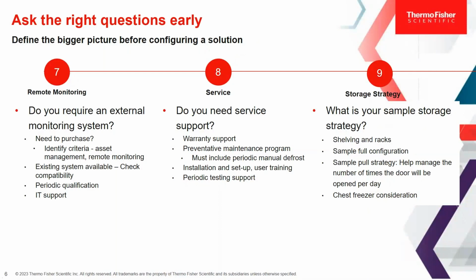And when you're looking at purchasing a new product, you don't want to just think about the initial warranty, perhaps you want to think about the 5-year plan. And maybe you want to buy extended warranty with that unit. Maybe you have internal support with maintenance and operations, and then that's covered. So think about that long-term plan. If something should go wrong, that you have the support that you need when you need it. And again, we have our Unity Lab Services solutions that can help with that for sure.